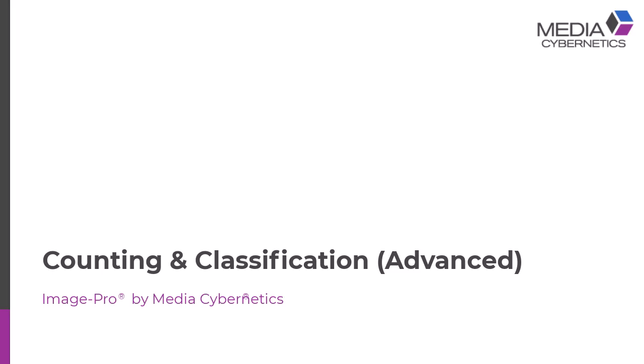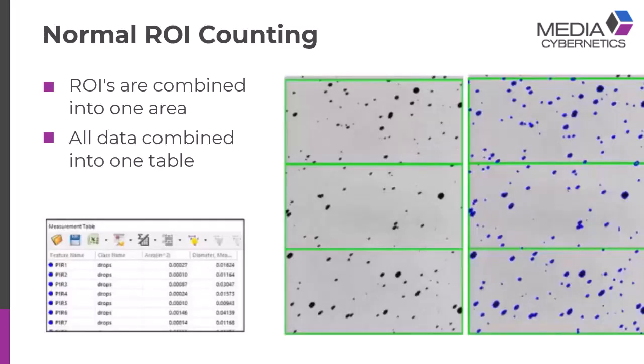So today I'm going to touch on advanced ROI object classification. Let me set this up. Normal ROI counting until ImagePro10 came out was along these lines.